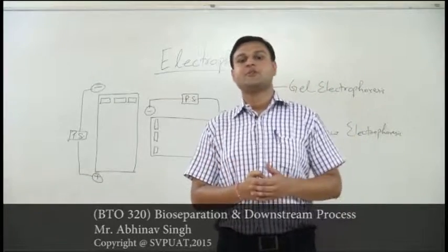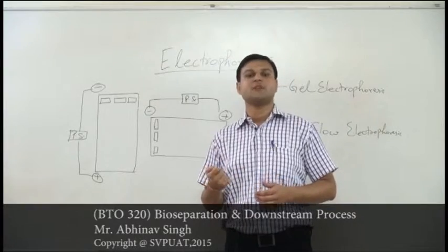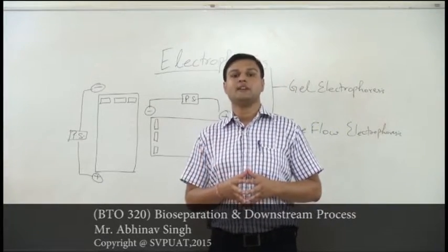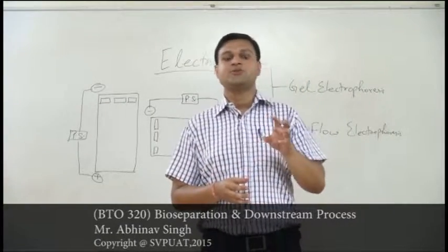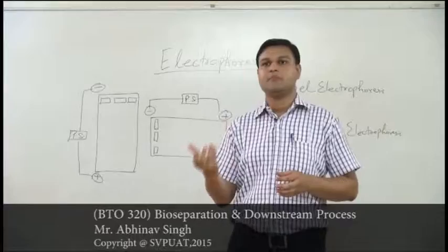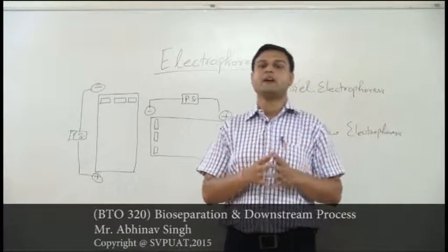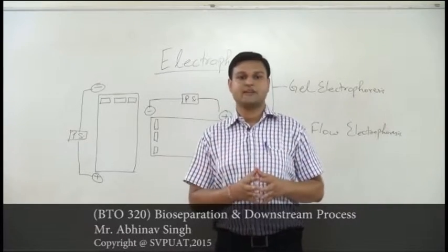How is electrophoresis going to separate? Electrophoresis is a technique that basically works on the principle of the separation of charged particles under the influence of an electric field. How is it going to separate the system? The solutes that are to be separated are mixed into the liquid, which can have electrolytes, and they are going to move either towards the positive electrode or towards the negative electrode.